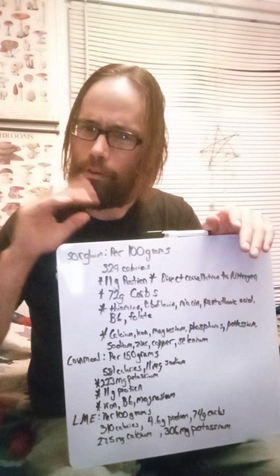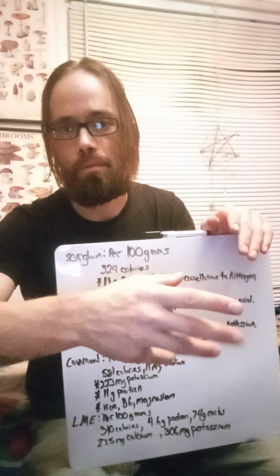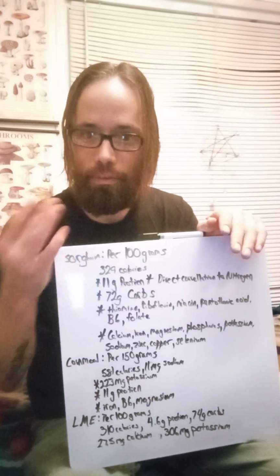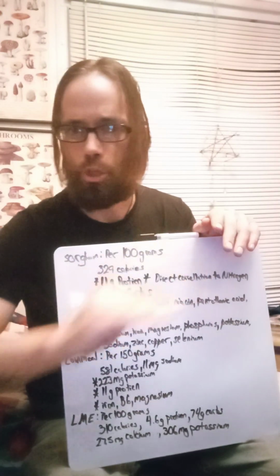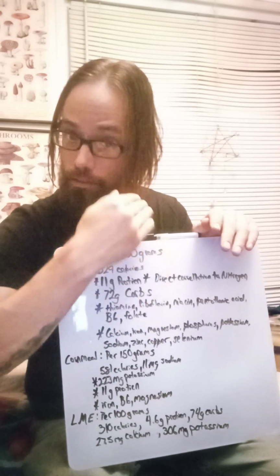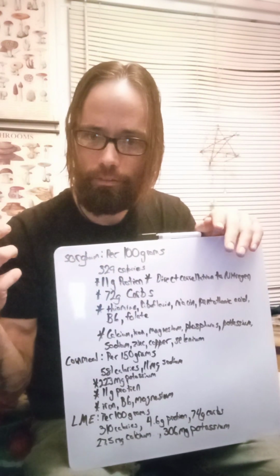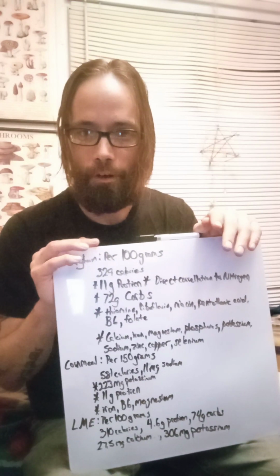So, I thought, what if I, kind of like when you throw potatoes or rice in water and boil it to get that broth, to make media. I boiled it like that, and then strained it. The following day I made another batch because I was totally obsessed with why, what is the problem here? Like, is it the cornmeal? Is there something that I just can't kill in the pressure cooker? I boiled it to extract, made that broth, made my media, no problems. All the plates poured good.